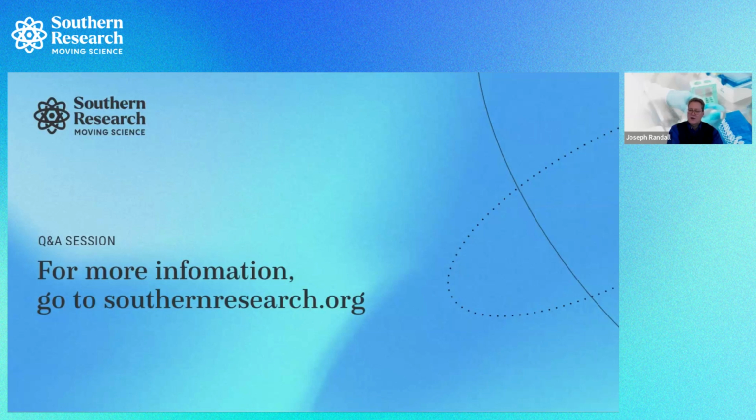And I would agree with you that the neonatal mouse model is overly sensitive, and you would have to take the data into context. So it's not currently a replacement for the monkey neurovirulence test. Our clients are using the mouse test as an adjunct to provide additional information on the dose response for neurovirulence in the mouse model.